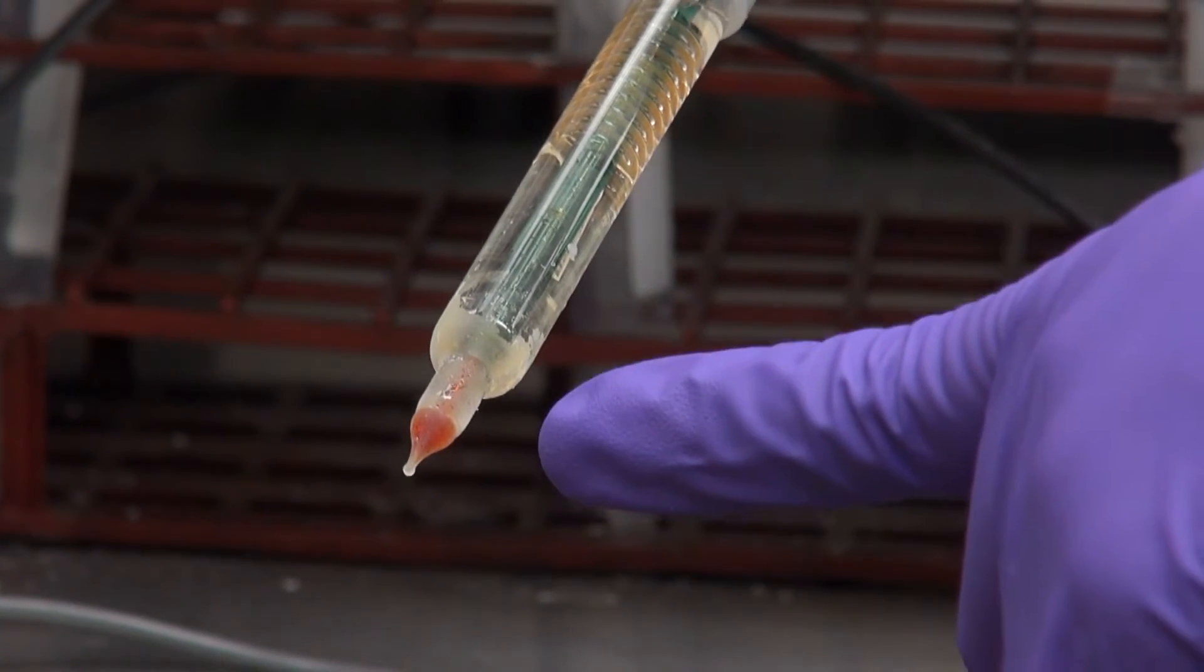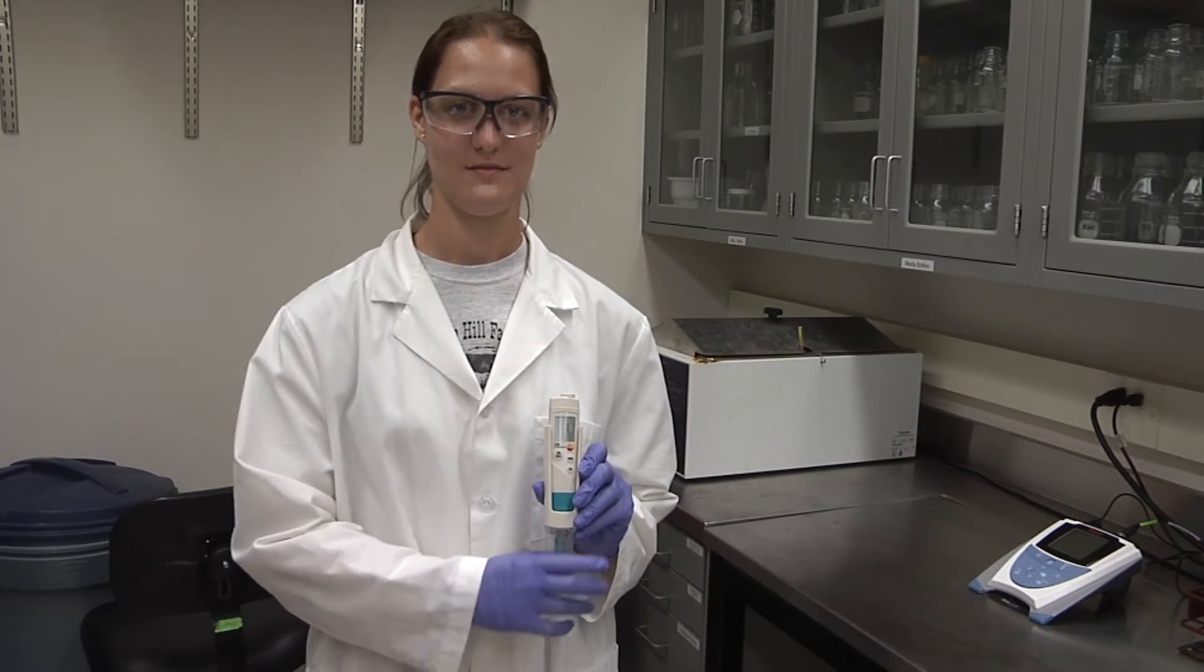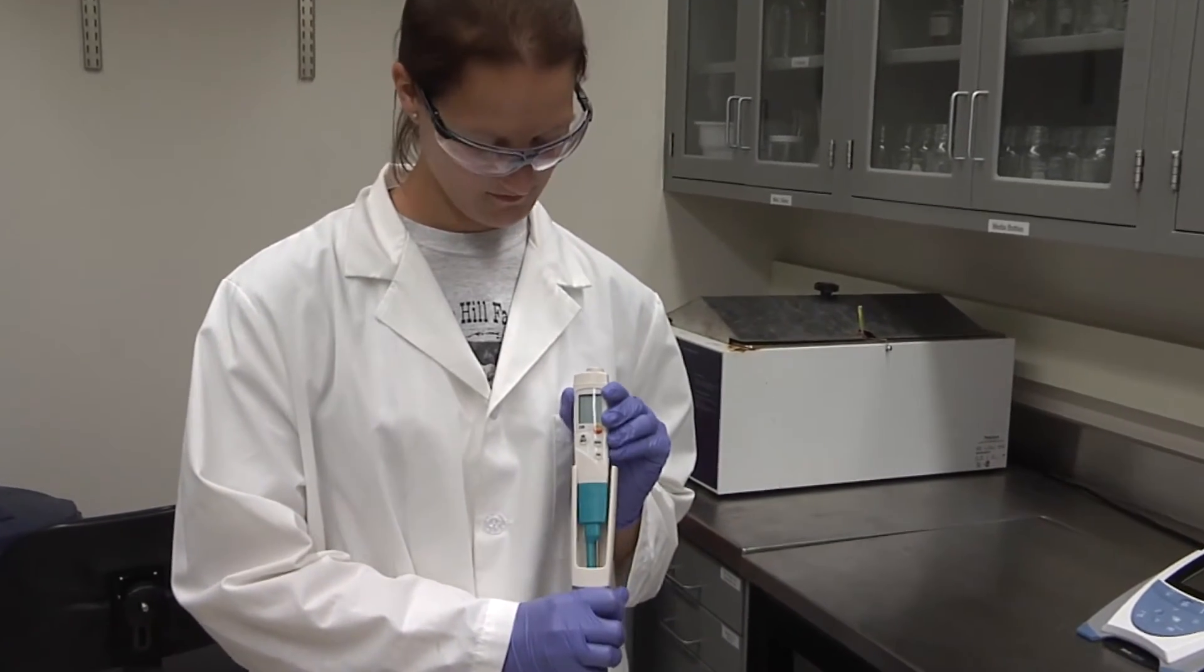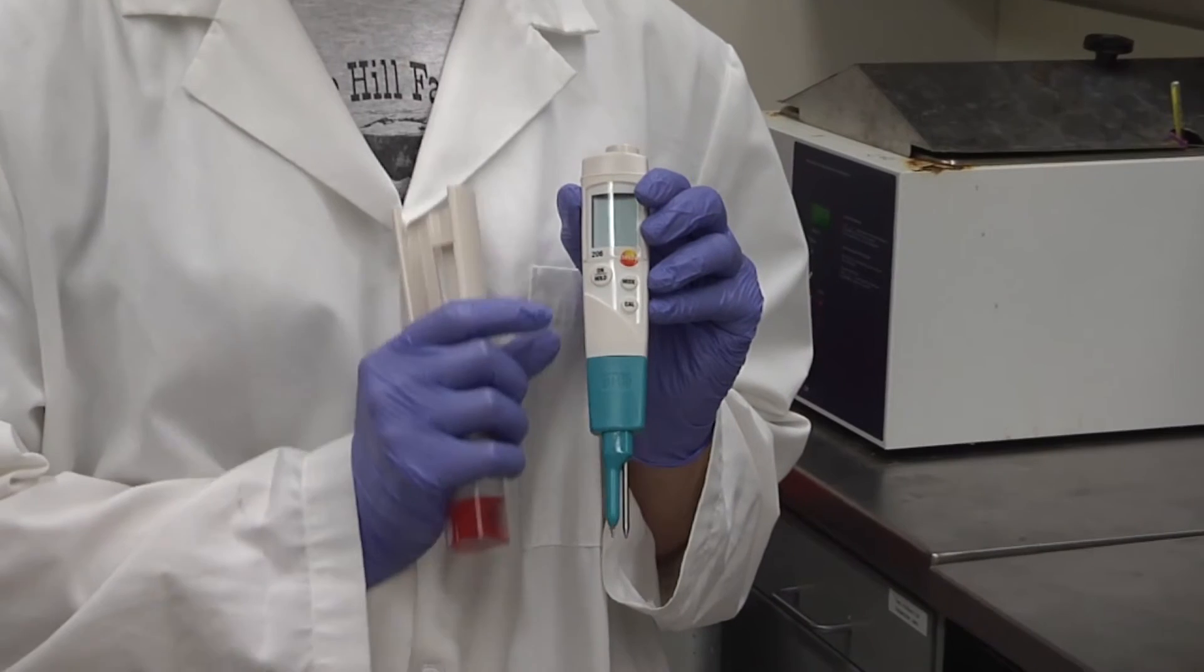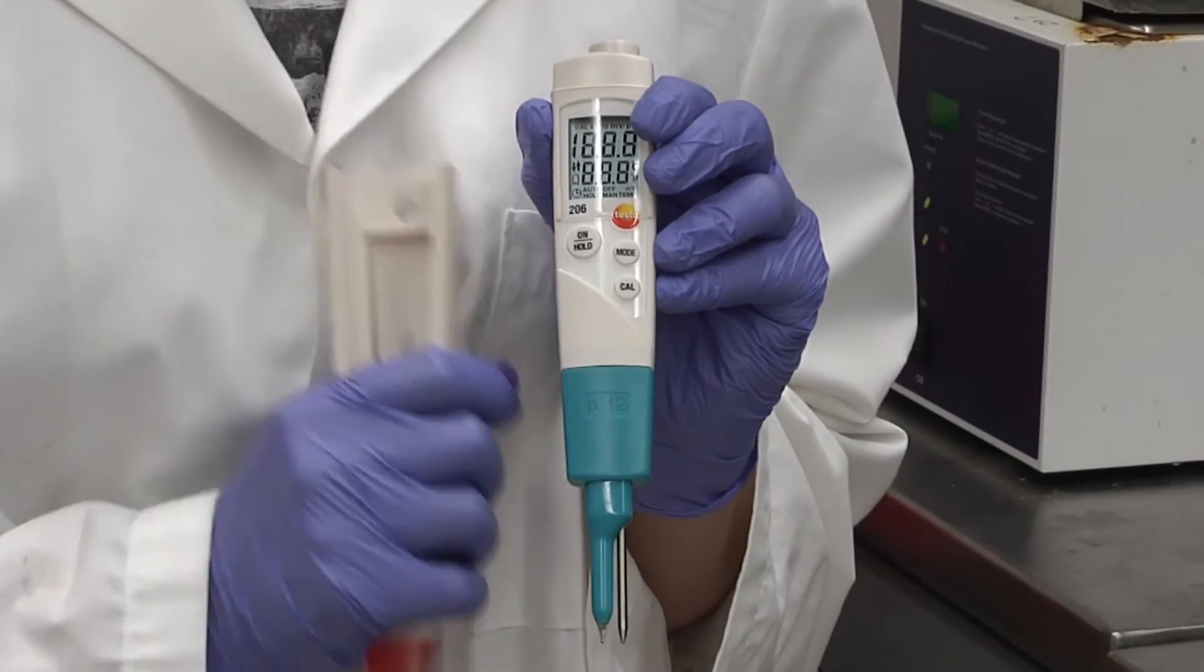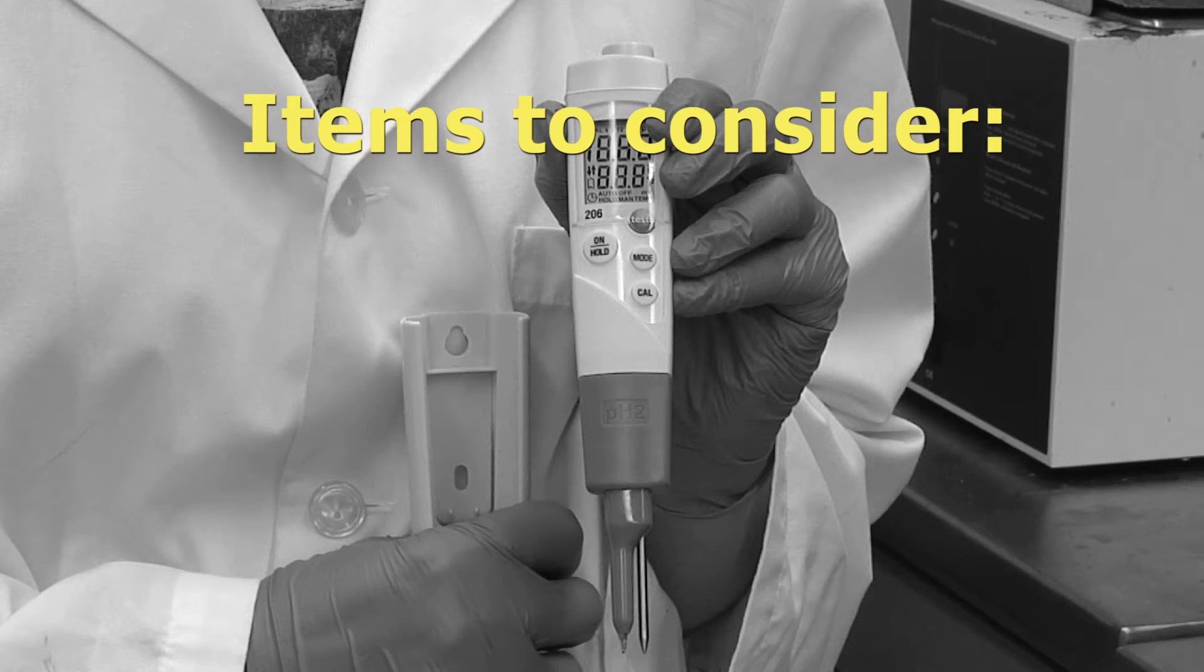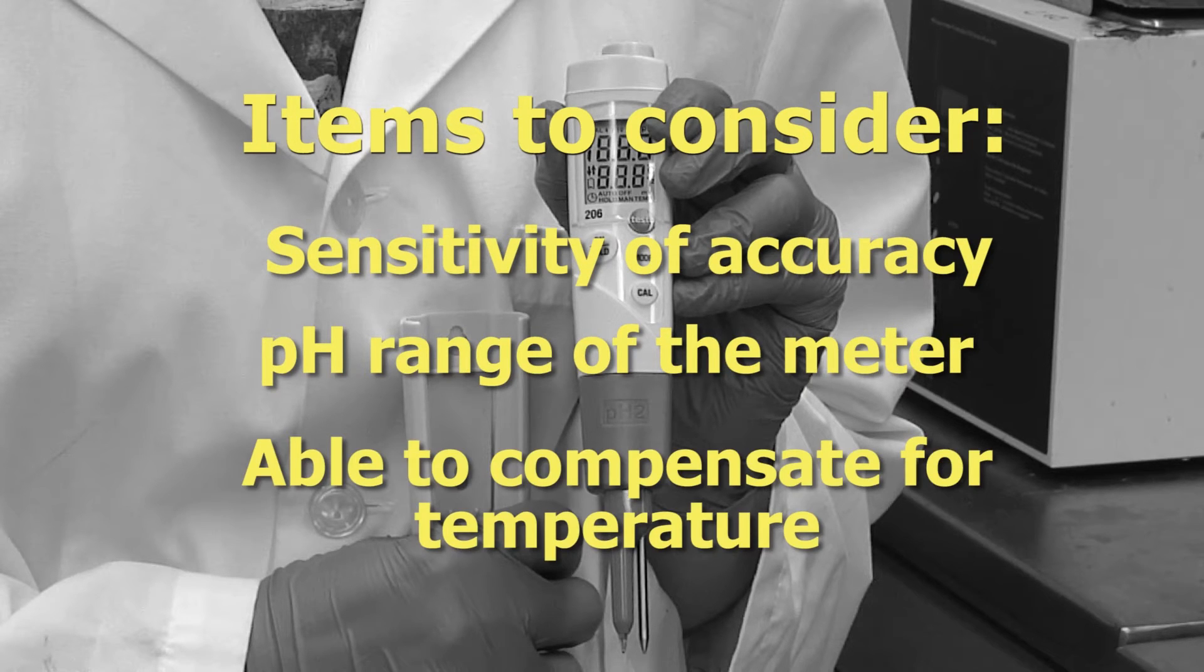Portable meters are ideal for the cost-savvy individual or where pH measurements need to be made in a variety of locations in your facility. When deciding upon the appropriate meter for your needs, consider more than just the costs of the meter. Items to consider when choosing a portable meter include the sensitivity of accuracy, the pH range of the meter, and if the meter is able to compensate for temperature.